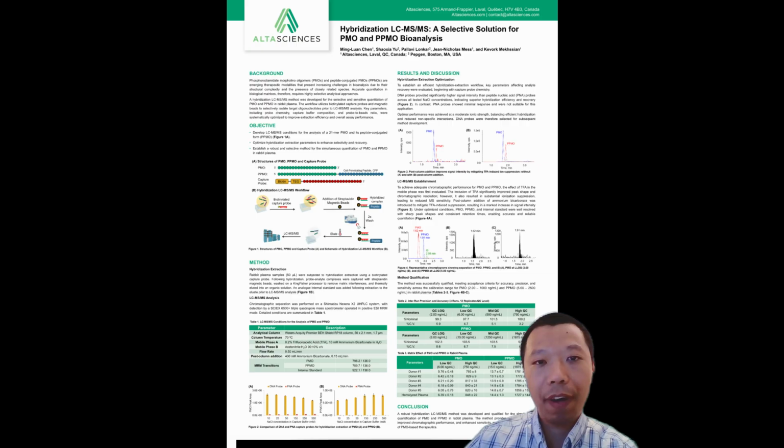The objective of this work was to develop a hybridization LC-MS method for the selective and reliable quantitation of PMO and PPMO in biological matrices. In addition, we aimed to optimize hybridization extraction parameters to improve selectivity and recovery. To achieve this, we developed a workflow combining hybridization extraction with LC-MS analysis.